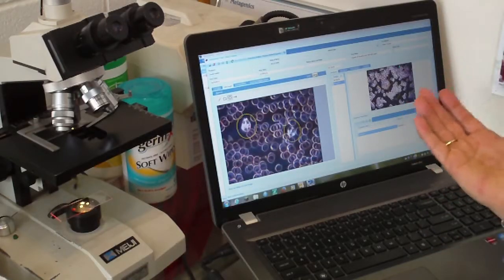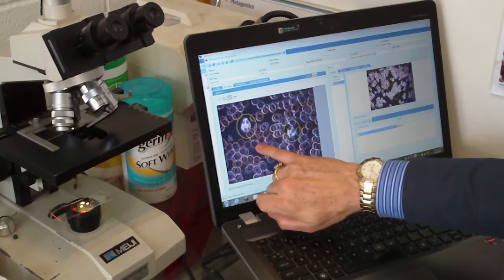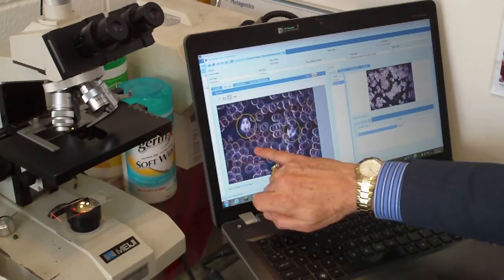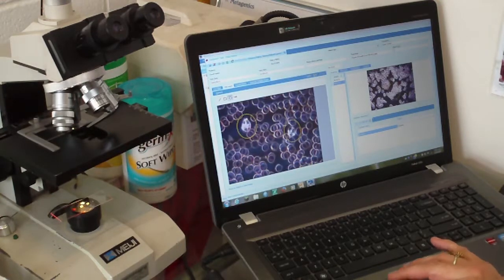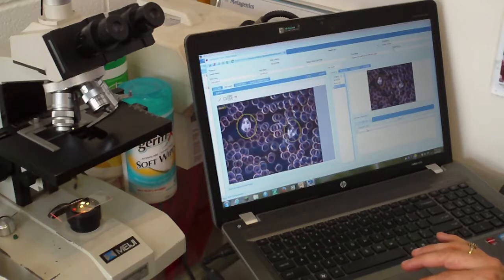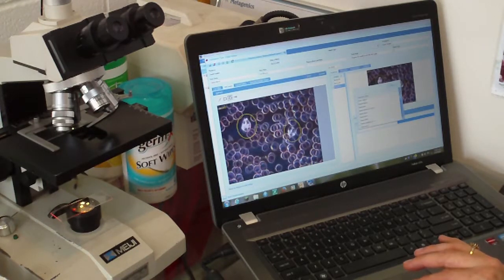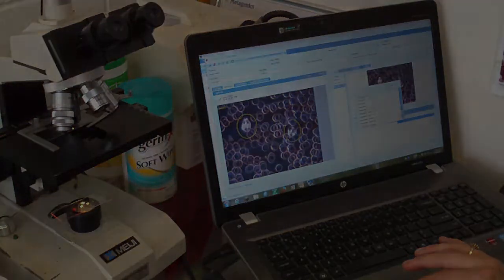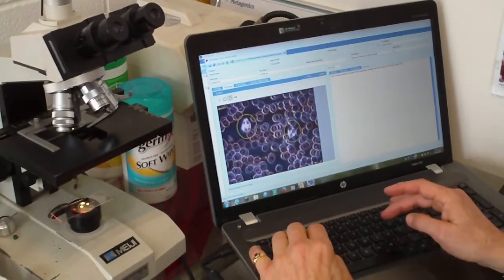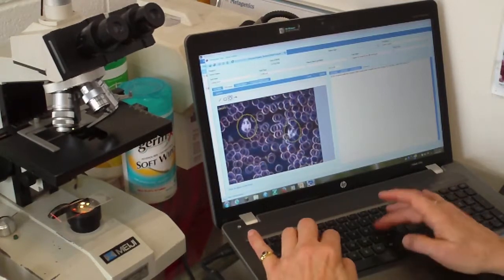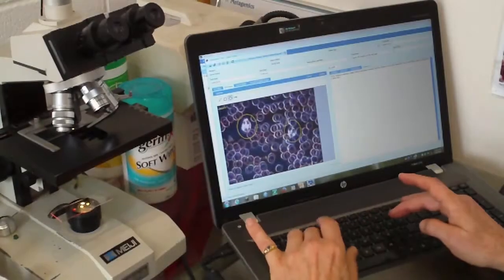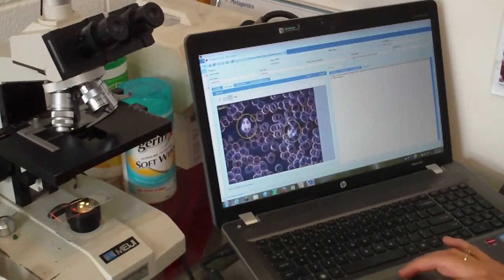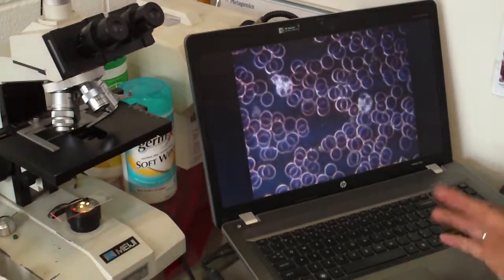So to give you an idea of how strong the magnification is, one of these red blood cells here, you can fit about a thousand to twelve hundred of those end to end on the head of a pin. So they're about eight to ten microns across in diameter. So you can see it's a fairly sophisticated microscope giving us a lot of detail, which is exactly what we want. So coming down here, we're looking at this is showing neutrophils are elevated. I put here raised WBCs due to mild infective agent or could be a food reactor or other stressor.